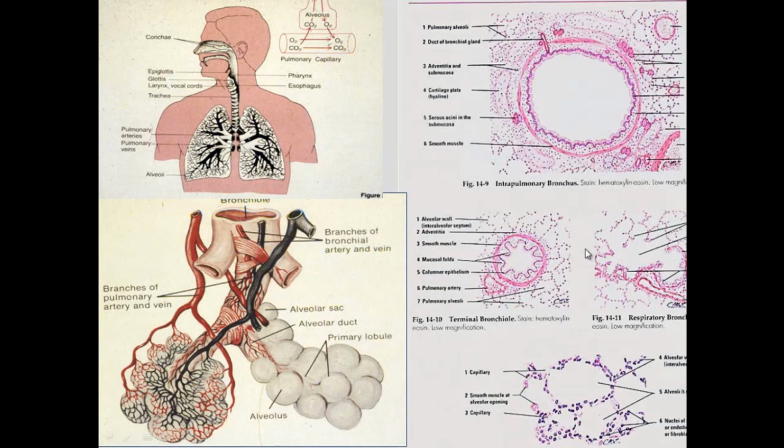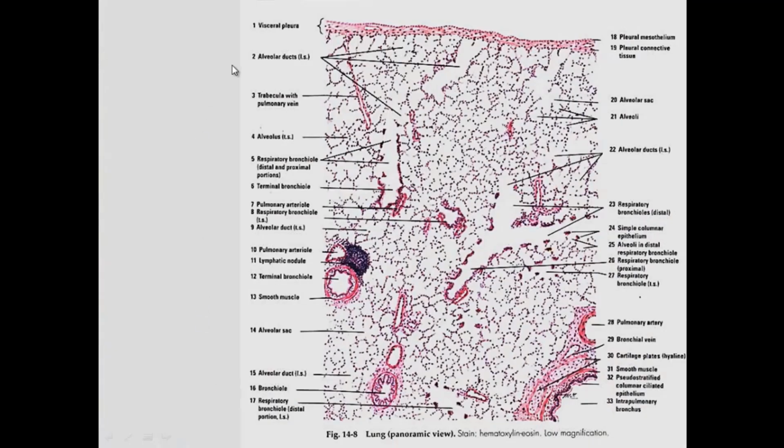When you lose those plates, you become bronchioles. So this, without the plates, would be a bronchiole, and this is a terminal bronchiole, and then that opens to a respiratory bronchiole, and then the alveolar duct, because it opens up to the alveoli, and these are alveoli located here, which is the same as these air spaces, and you would have capillaries in the wall, just as we see there.